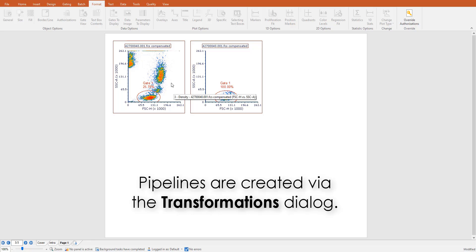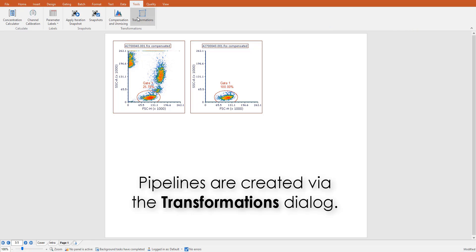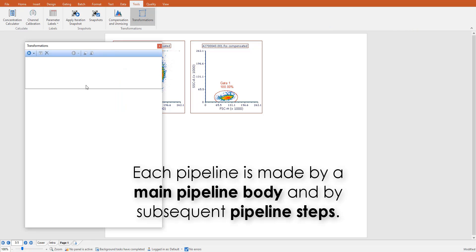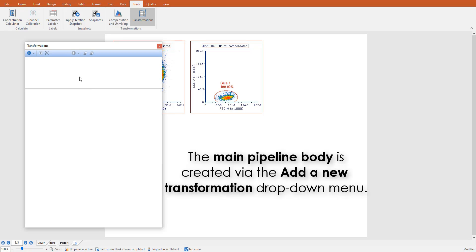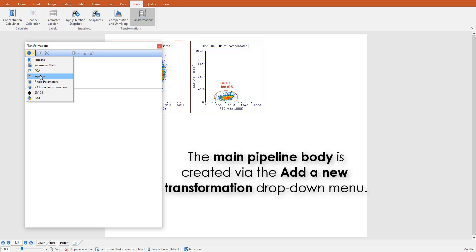Pipelines are created in FCS Express 7 through the transformation dialog. Each pipeline is made by a main pipeline body and a variable number of pipeline steps. The main pipeline body is added through the Add New Transformation drop-down menu.